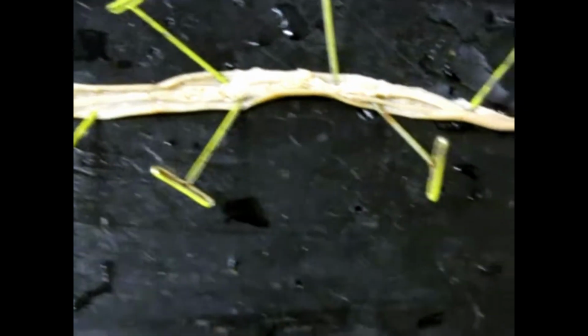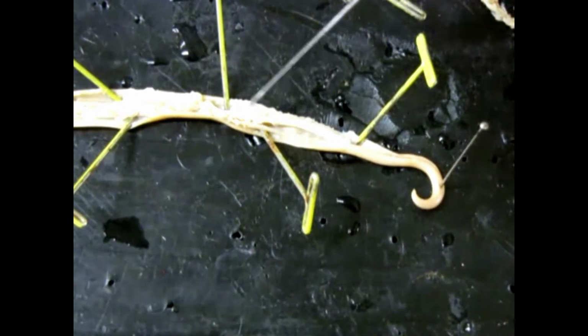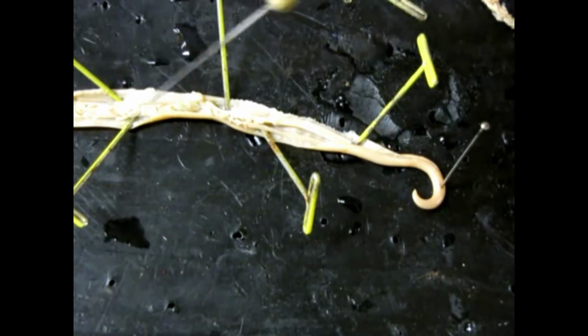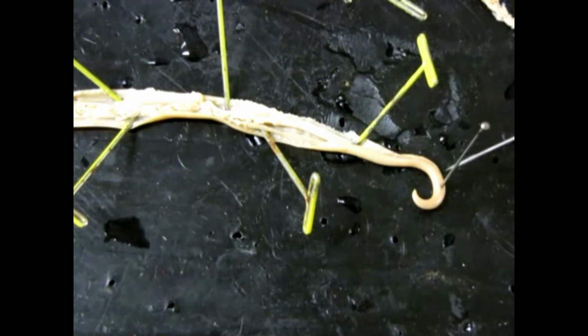Okay, if we go to the posterior end of the animal, we can see this thickened tube here, and that passes about three-quarters, half the way down the body. That's the seminal vesicle. All right, and that exits out through the anus down at the posterior end of the animal.